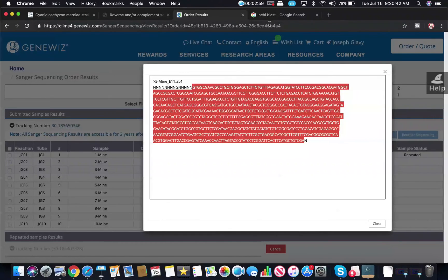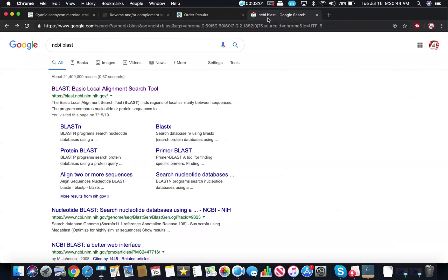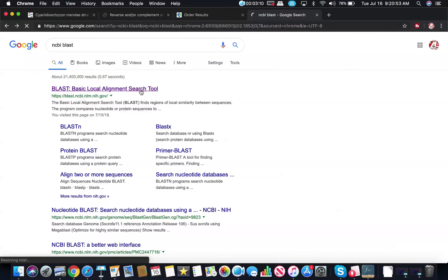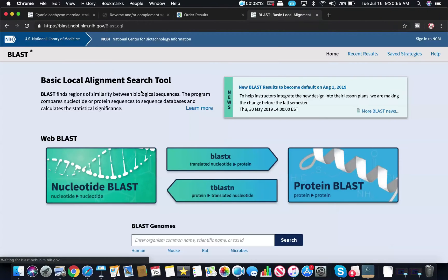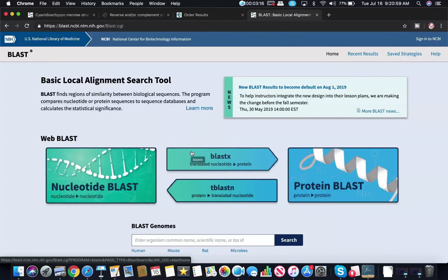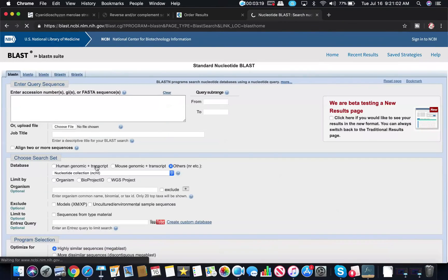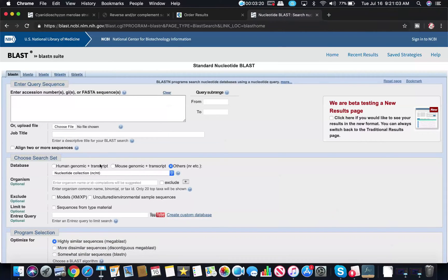I'm going to copy that and then I'm going to go to NCBI BLAST on Google. This is one way that you can get to the BLAST website. BLAST stands for Basic Local Alignment Search Tool. I'm going to click on this link and then I'm going to click on Nucleotide BLAST. There's other forms of BLAST. Nucleotide BLAST is the most common one. We're going to use it.